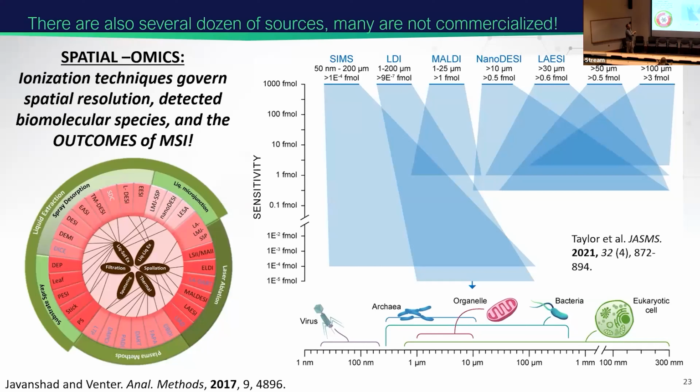And this is where we have nano-desorption electrospray, desorption electrospray, and liquid extraction surface analysis. Has anybody here used a pipette before? You can imagine pipetting and aspirating your liquid over the actual sample, but then the LESA device takes that and directly injects it into the mass spectrometer. So it's more or less a manual process, and a lot of these things came from the fundamentals of just liquid-solid extractions, liquid extractions, whether they're sputtering or thermal desorption.